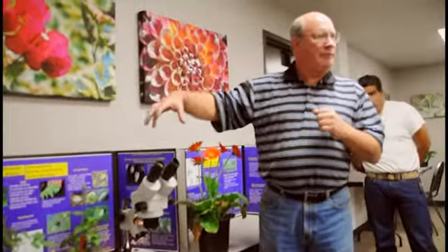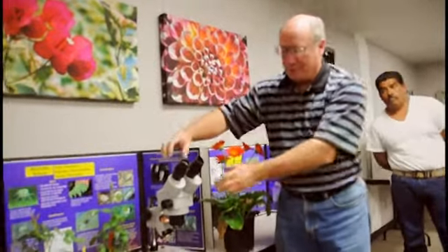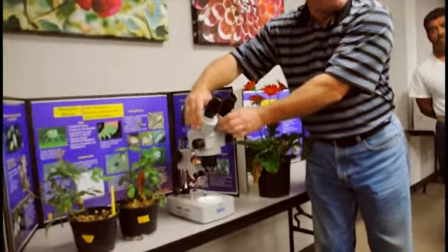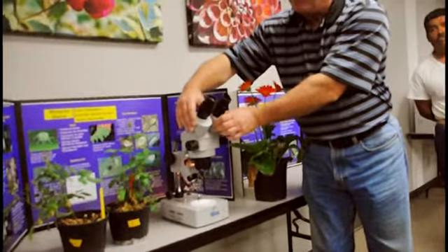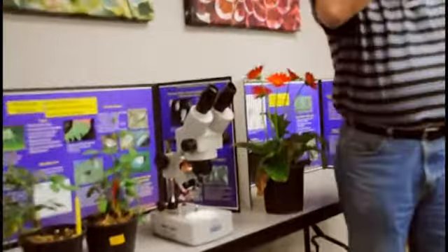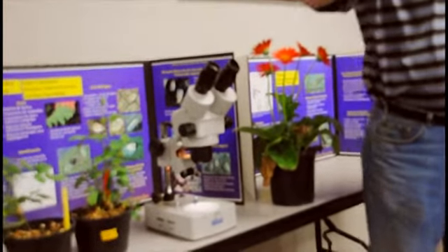So there are several parts that I want you to understand. One is that each person's eyes are a different width apart, and so the top part of the microscope will actually separate. These oculars will move so that they can separate for your eyes. So you want to set it to the width of your eyes. Otherwise, it's two images, and you bring it together so you see one image.